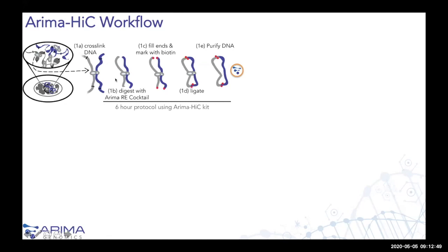Once you have your digestion here, those ends get labeled with a biotinylated nucleotide and then ligated back together.